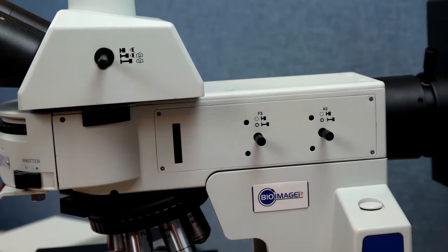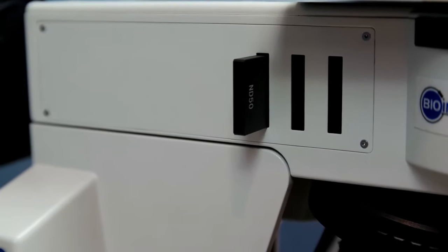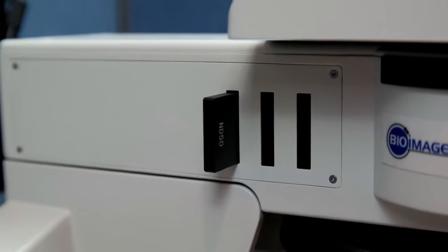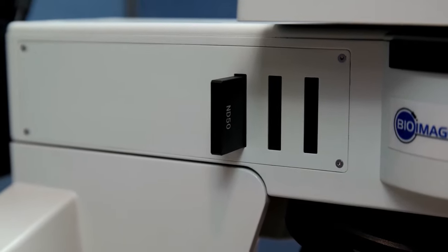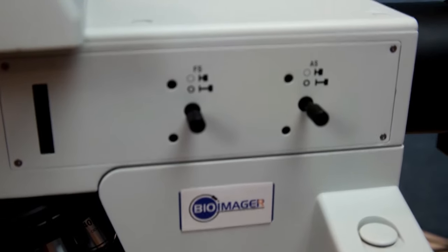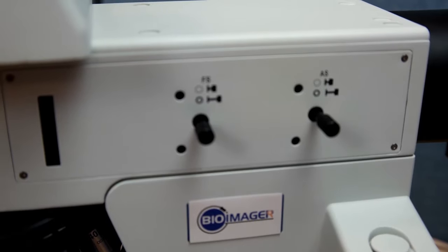The attachment allows installing two neutral density filters at the same time and has aperture and field diaphragms.